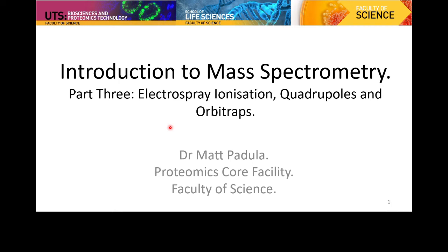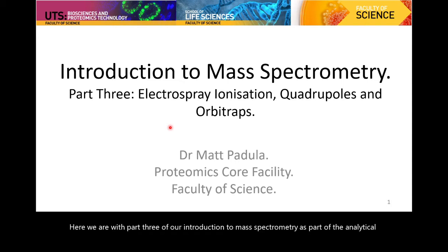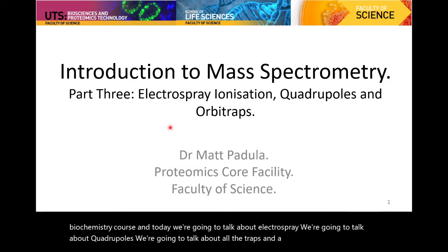Here we are with part 3 of our introduction to mass spectrometry as part of the analytical biochemistry course. And today we're going to talk about electrospray, we're going to talk about quadrupoles, we're going to talk about Orbitraps, and a few other mass analyzers.